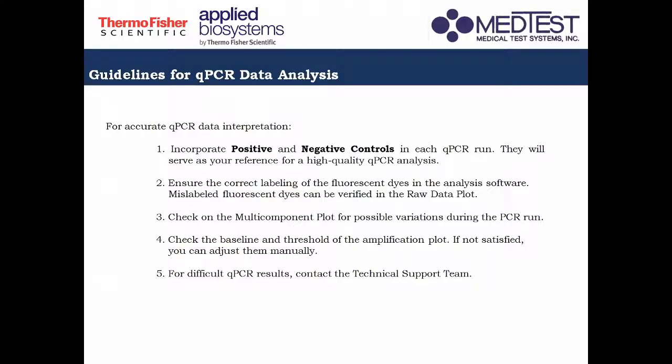Now for difficult qPCR results, which is really unavoidable kasi, I mean we are dealing with very varied sample types, and then ibang tao pa yung tinetest natin. So most likely meron din tayong mga very difficult qPCR results. So when that happens, you can always contact us, the field application scientists, so that we can help you how to proceed with your data analysis for that one.